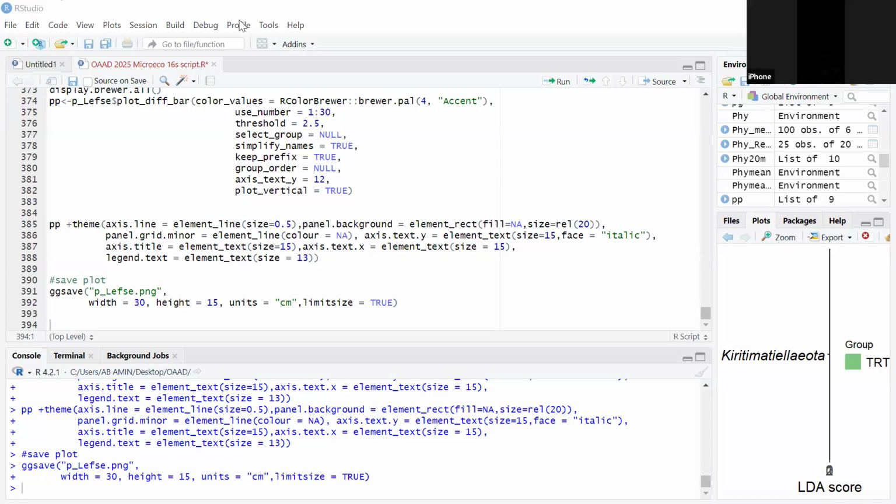My brief question is, if I want to determine the absolute abundance from 16S sequencing, how should I do it, for sequencing that was done using spike-in for the prokaryotic bacteria? How do I determine the absolute abundance, not relative abundance, but absolute abundance, after conducting full length 16S sequencing with spike-in?